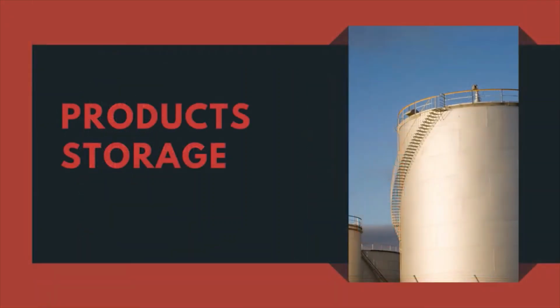In the refinery, so many products are being produced and then they go to their respective storage tanks. In the storage tanks, the products get collected and once the tank is full, they are routed to another tank. Once the tank is full, this tank can be tested and once the testing is perfect, the contents of the tank can be taken to market. So, how is it being done?